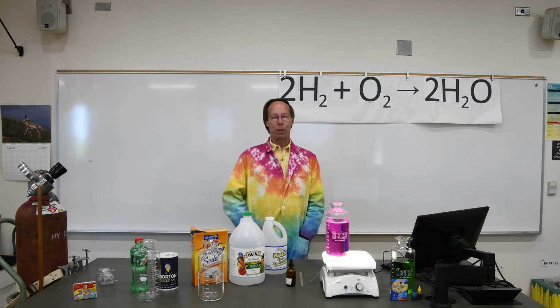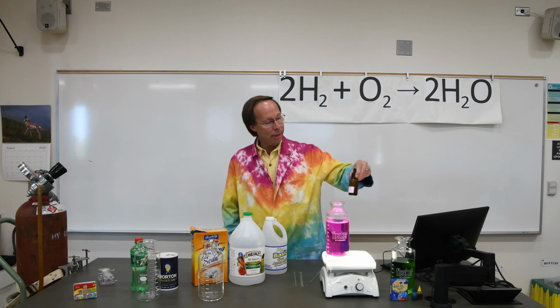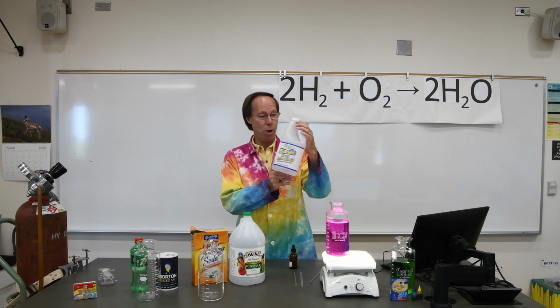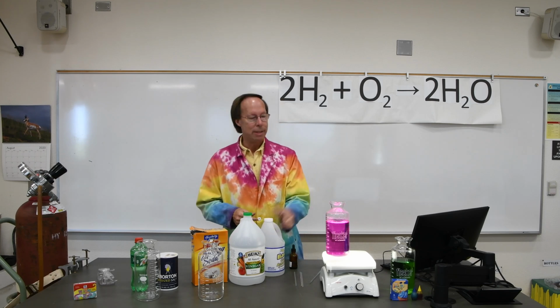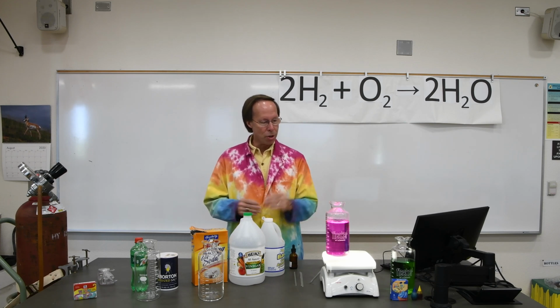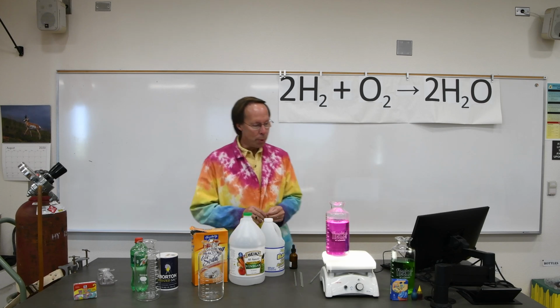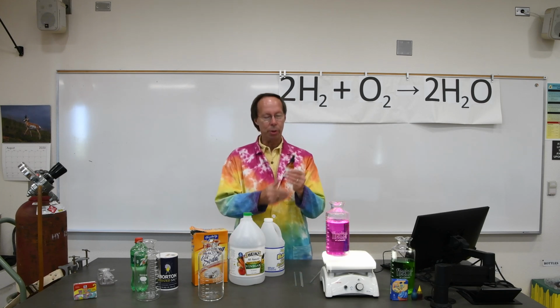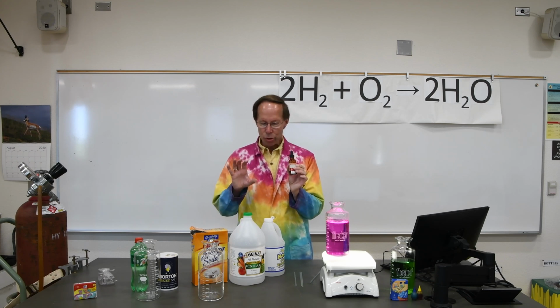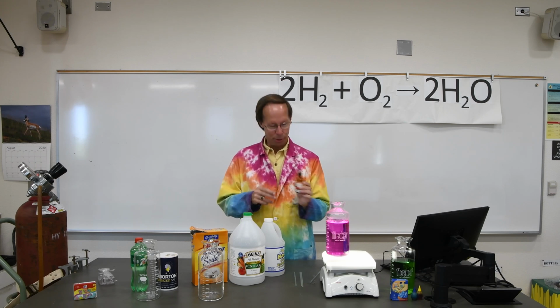Now, was that a chemical change? In this case, absolutely, because the phenolphthalein had no color to start with. The ammonia was colorless, the water was colorless, yet now we have this lovely pink color. A color has appeared that was not there before. Color change, definitely a chemical change. When you add a base to the phenolphthalein molecule, it undergoes a chemical reaction. It changes its chemical structure just a little bit, and that new molecule happens to be pink in color.